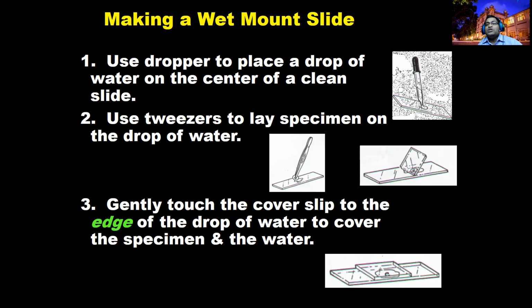If you are going to observe the microorganisms inside a plant or inside the host, then you have to take a very thin cut. You can take a very thin specimen. For that purpose, you can use a pith. Pith may be anything inside certain plants; we call it a pith.